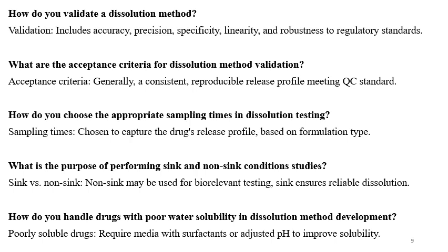What is the purpose of performing sink and non-sink condition studies? So non-sink conditions are sometimes required for biorelevant testing, and sink condition ensures reliable dissolution. If you justify the dissolution discriminatory power, you can also use non-sink condition for some of the molecules.